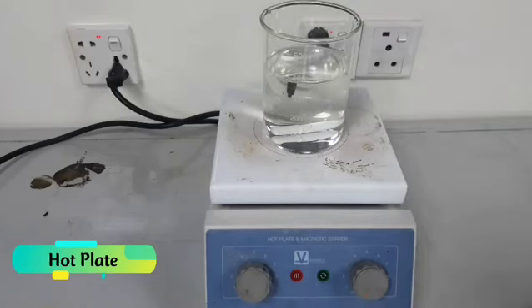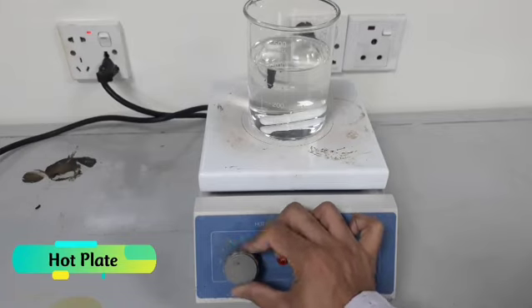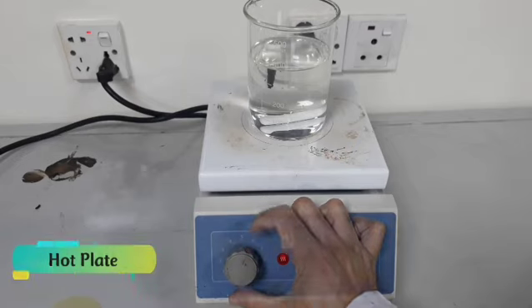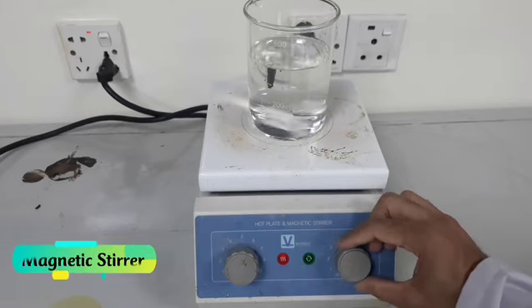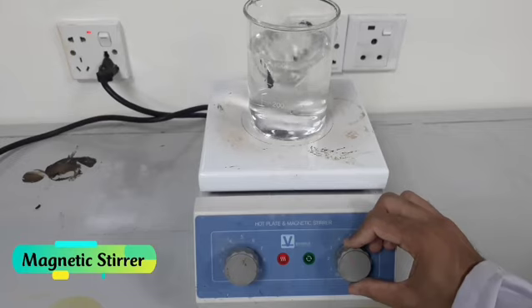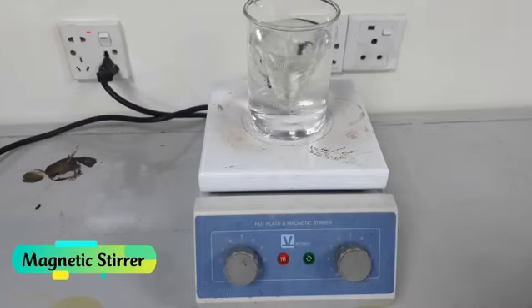It dissolves solids into solvents, prepares buffer solutions, and maintains a uniform temperature in chemical reactions. It is useful in microbiology, chemistry, food technology, and pharmaceuticals. It provides both heating and stirring at the same time, ensuring homogeneous mixing and preventing localized overheating.